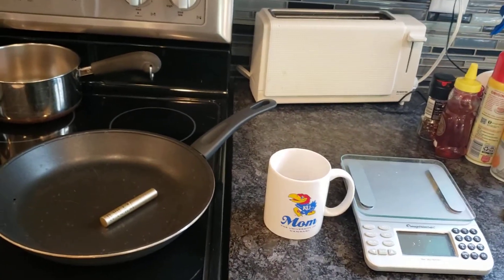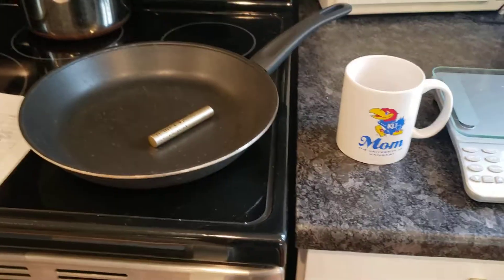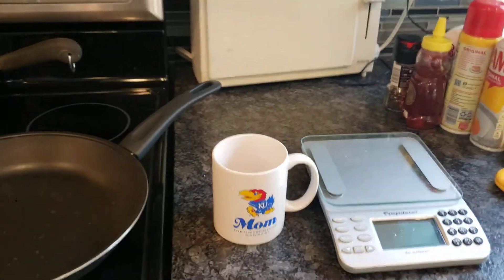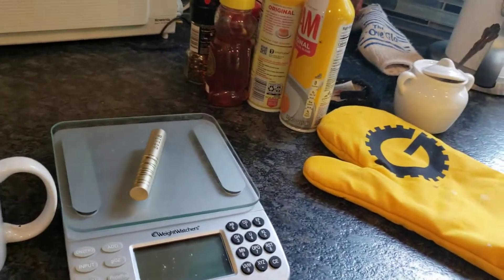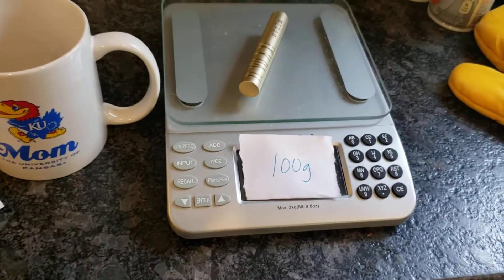Welcome to Crazy Labs with Mama Bush. For this lab we are going to take this piece of metal and find its mass. The mass is 100 grams.